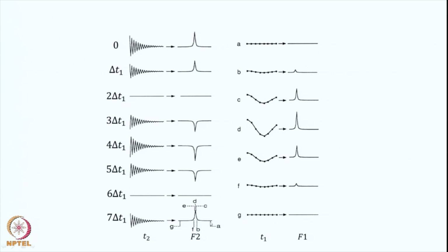Now what you do is you take this point in each of these spectra, and plot them here. So let us look at point A. Point A, this here, this here, this here, and you put all these points here. There is no variation here, right, because it is all the same. Now we come to point B. The point B, this one is here, and here it is 0, and then it is here, then you take this here, here, and here, and you plot that here.